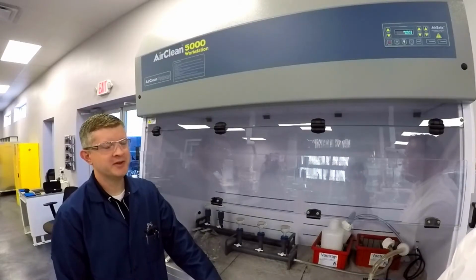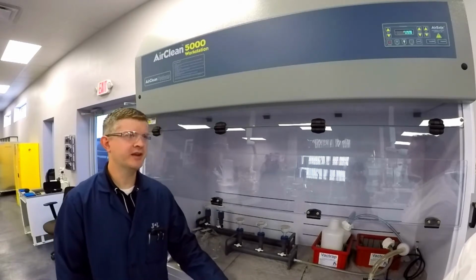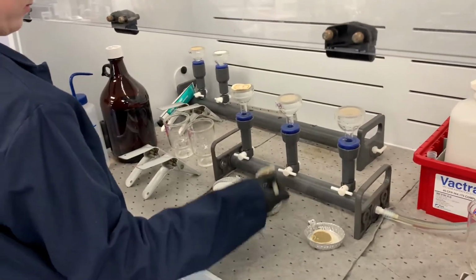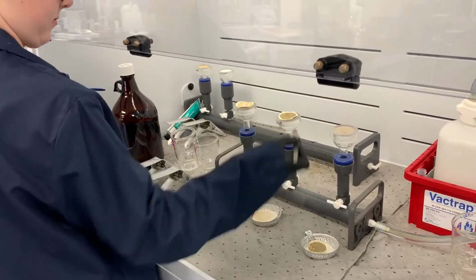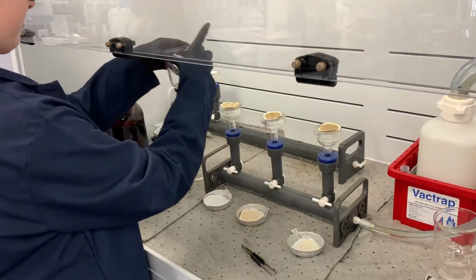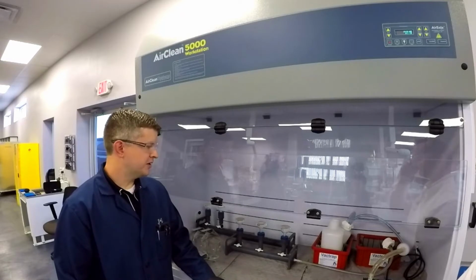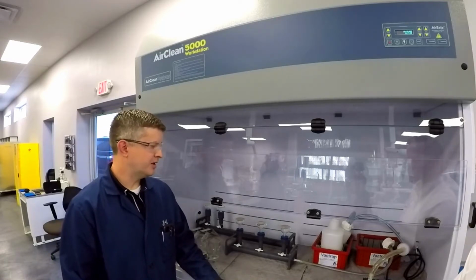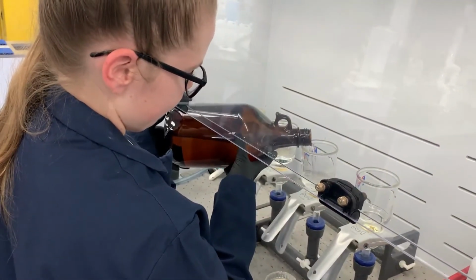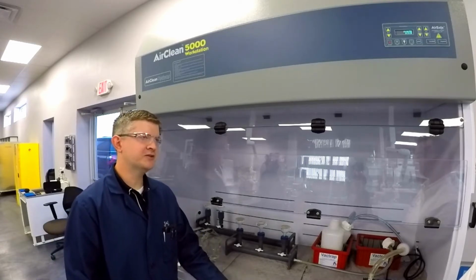Millipores are useful for SWD operators. It's kind of a health check on seeing what kind of fluids they're injecting downhole. So what we'll do is, after the customer samples the Millipore out in the field, it's a 0.45 micron filter. It's going to be capturing residue. So these are suspended solids that are being captured and filtered out on their way downhole. So we're able to quantitate these, the percent hydrocarbons. We'll do a xylene step, so we have hot xylene, we'll pour it through, we'll dry it and weigh it, and that'll give us a percent composition of hydrocarbons.